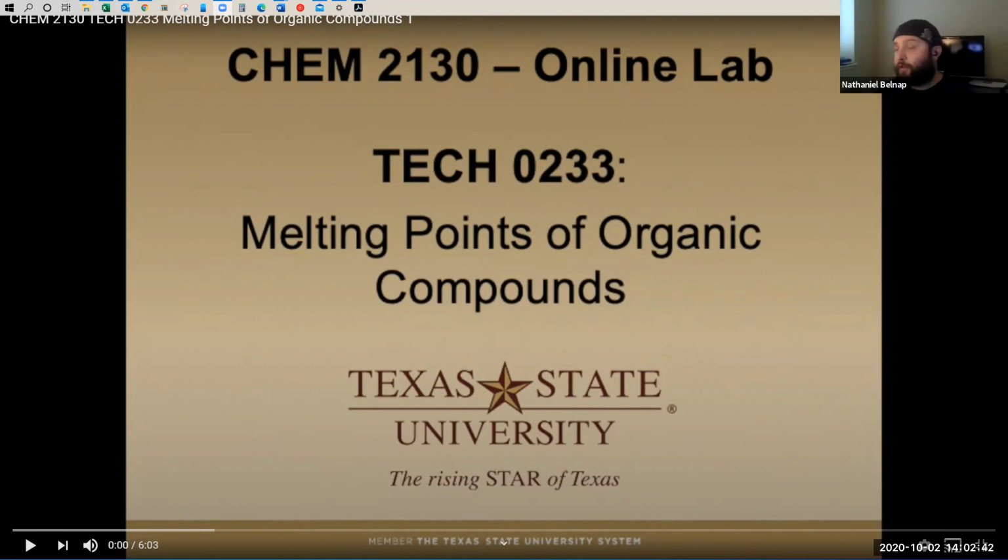So at a certain part in the video, there's going to be a part where you have to record a melting point range for three different compounds. For the first one, I don't know if anyone wants to volunteer, but I would like someone to tell me when they think the melting starts, at what time in the video, what temperature it says, based on just what you see. And then we'll see, did you get it spot on? Were you a little off? Were you a little late? Whatever. Just to try to make this a little more of an engaging lab, because it's a pretty straightforward lab. You're just watching something melt, and that's pretty much it. So anyway, let's get started.